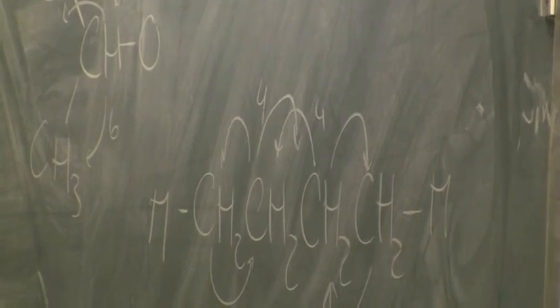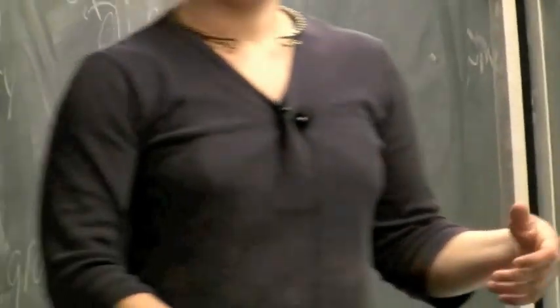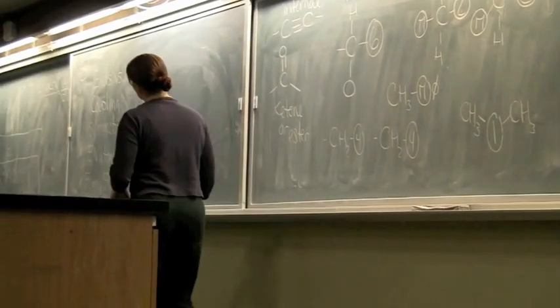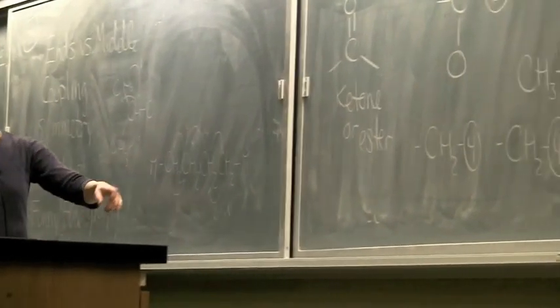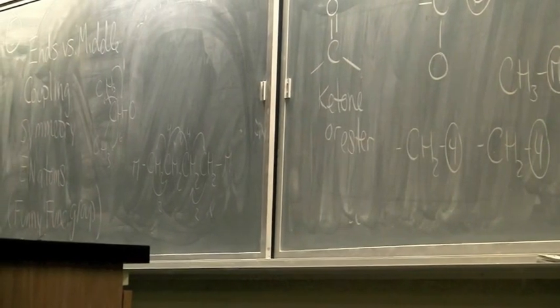How are we doing? So now because we've finished all of our coupling, we can start talking about chemical shift. We can start talking about where's everybody kind of put together. So chemical shift, or electronegative atoms, we've got some stuff next to pi bonds. If we put them both next to the same pi bond, we'll make a ring and we won't be able to finish off the molecule.